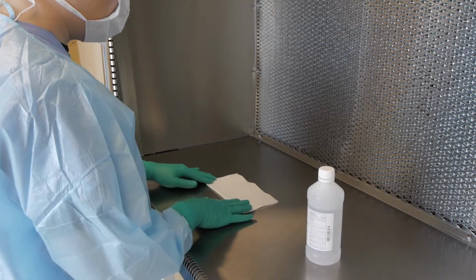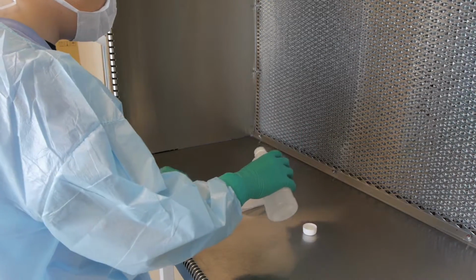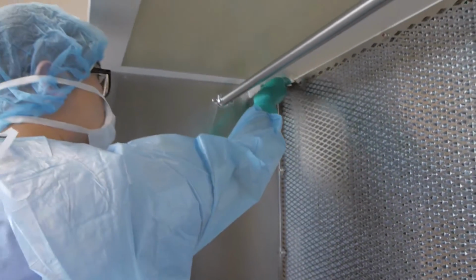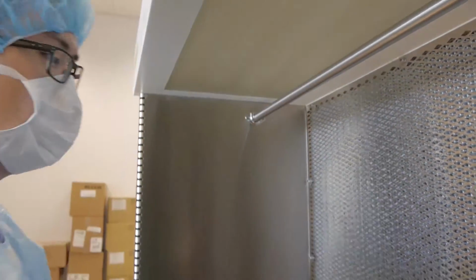When cleaning the hood, fold a sterile wipe into fours. Make sure to only pour alcohol directly onto the wipe and not the working surface. Use the snake pattern to clean the hood from inside to out, making sure to only use one side of the wipe to clean each section of the hood.